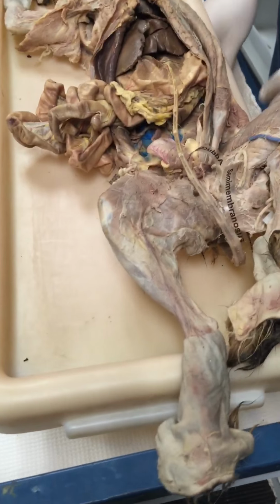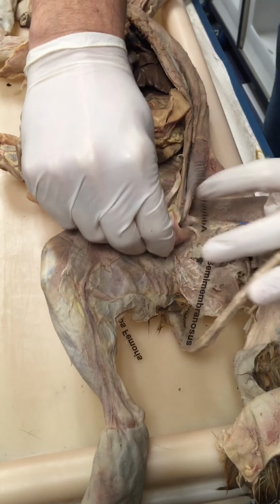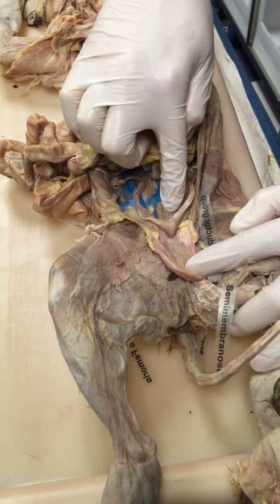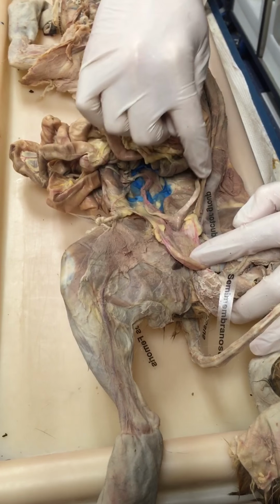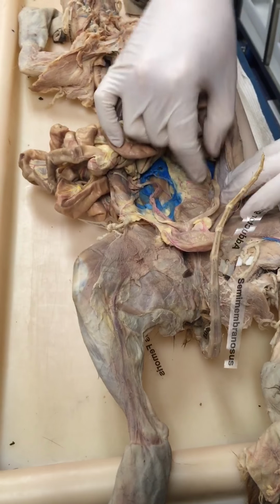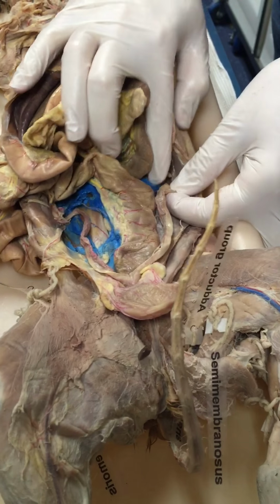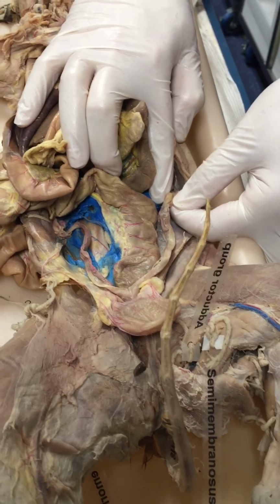Make sure you guys gather around so you can see this. So again, remember, pull the urinary bladder up, and when you pull it forward, notice you don't see just the rectum, you see the little Y coming out. So here's the uterus and here are the uterine horns. As you follow those up, you get this little bean-like looking structure. See right there? I can get underneath it. It looks like a little pea or a little black-eyed pea.